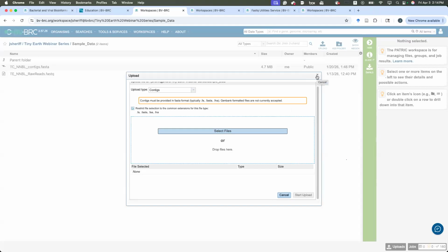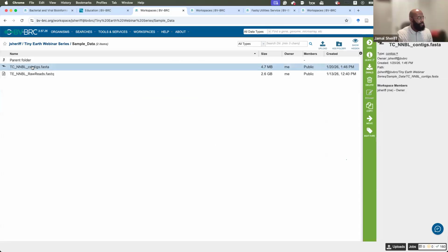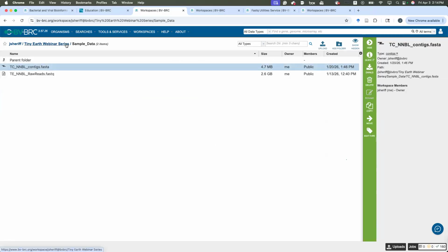So, Jamal, can I interject? Yes. So if you close out of there and have your FASTA file selected, if you didn't select contigs, you are able to change the type there.